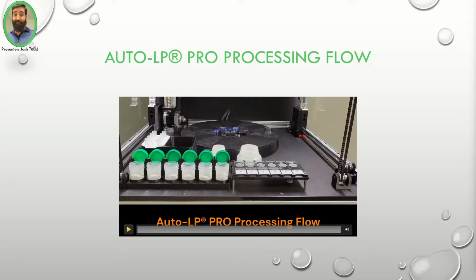Now we're going to watch a quick video on the processing flow on the AutoLP Pro, how to prepare for your next specimen run, and how to prepare more specimen runs throughout your day.